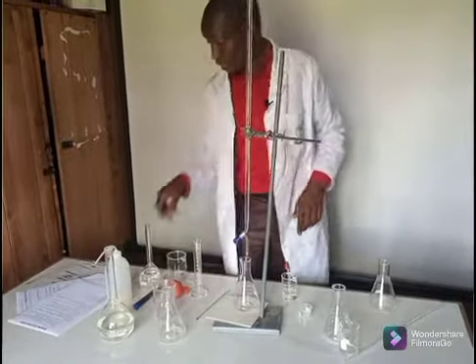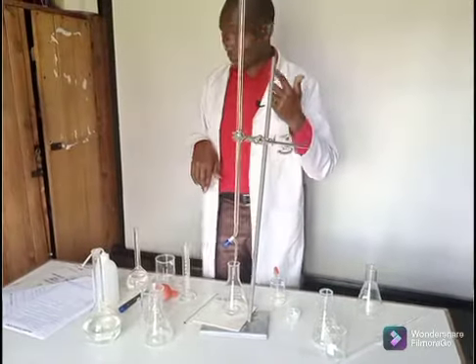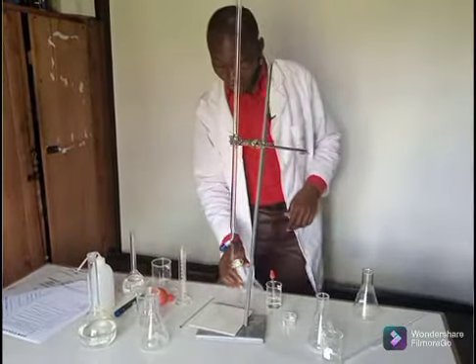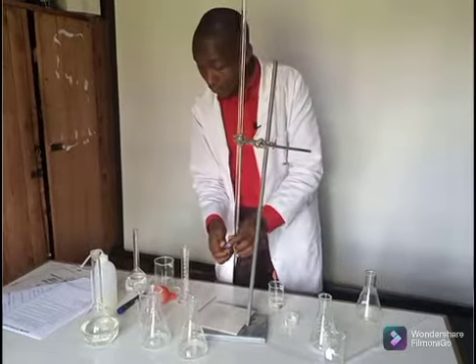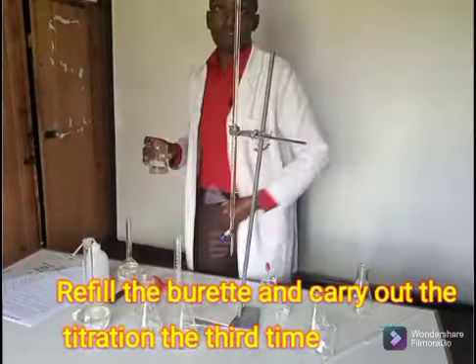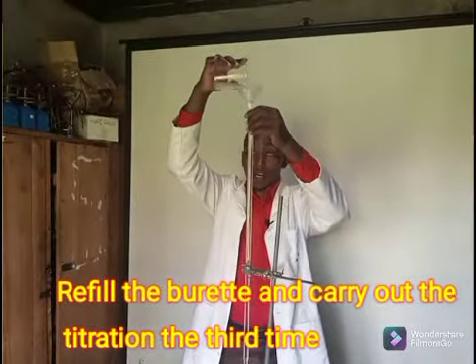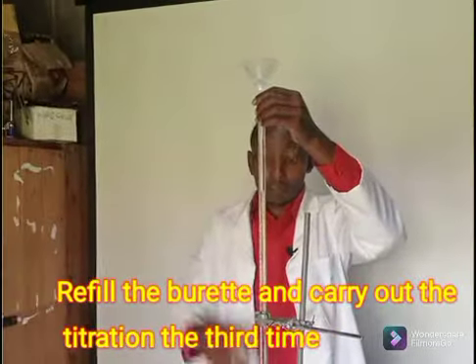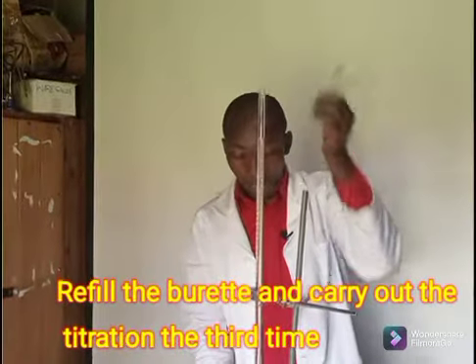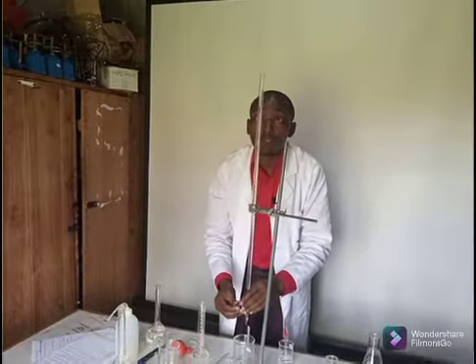Remember, my first trial was 25.1. Now I'm at 24.9. Good. Even as I do the third trial, remember I can still do the top up again. I fill the burette to the mark again and do the very last trial. Even if I don't do the third trial, I know the range of this volume.